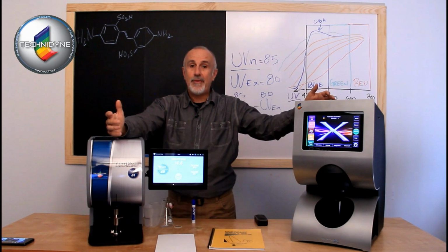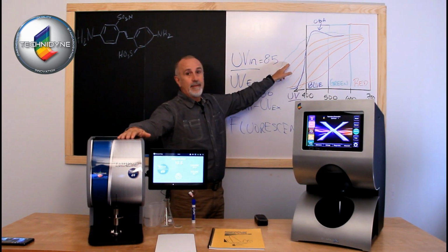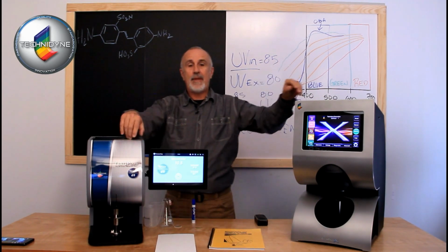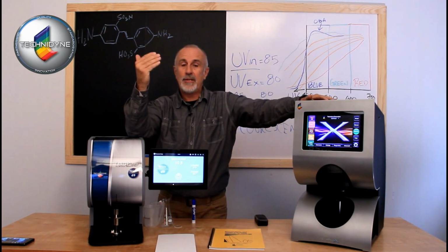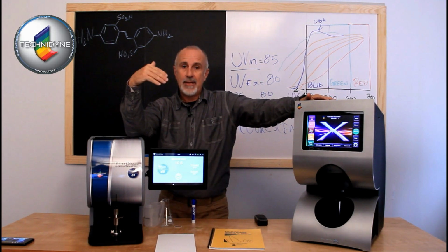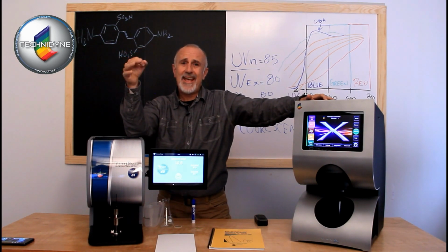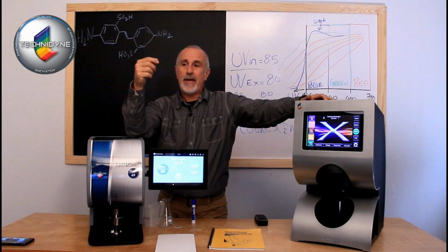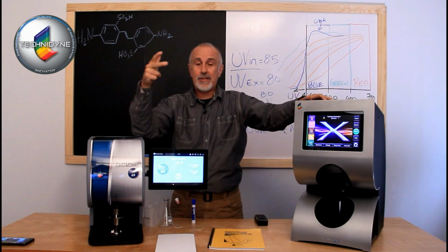So the D65 source was developed, and that is a very UV-rich light source, not dissimilar to what this green line represents here. That is a flash lamp, a xenon flash lamp. So the 395 filter is then used to trim that energy to be able to get the D65 level. So today in the ISO world, you've got C source, you've got D65 source, and you have UV excluded. Okay.